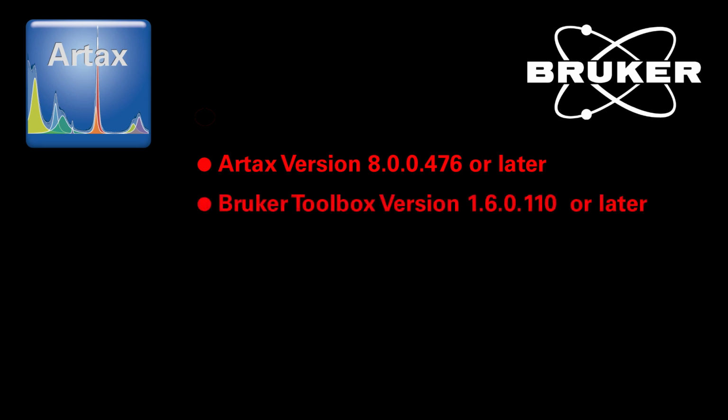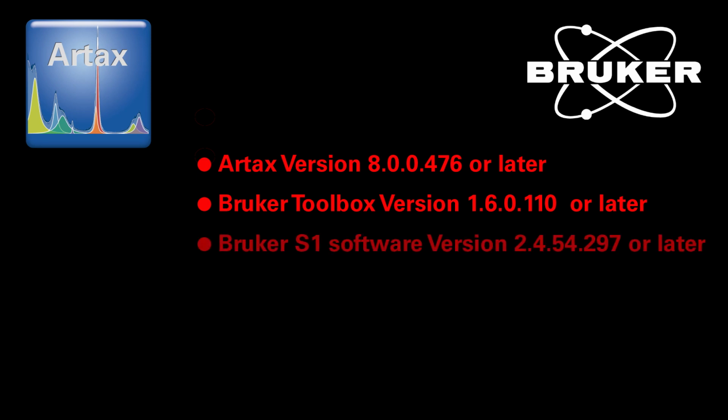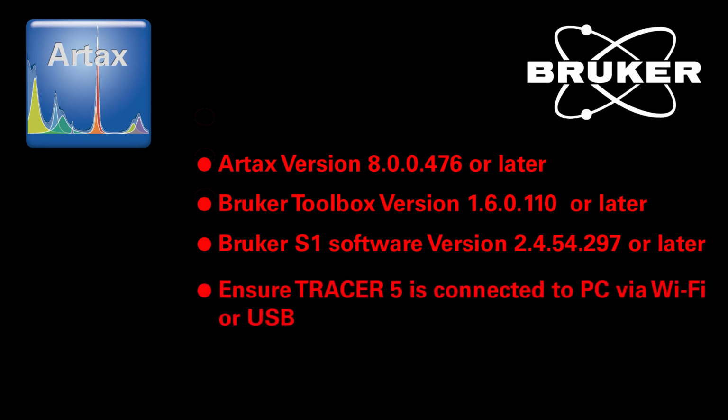Our beginning assumptions are that you have Artax version 8.0.0.476 or later, and Bruker Toolbox version 1.6.0.110 or later installed on your PC. And you have Bruker S1 software version 2.4.54.297 or later installed on the instrument. Finally, we assume that your instrument is connected to the PC.